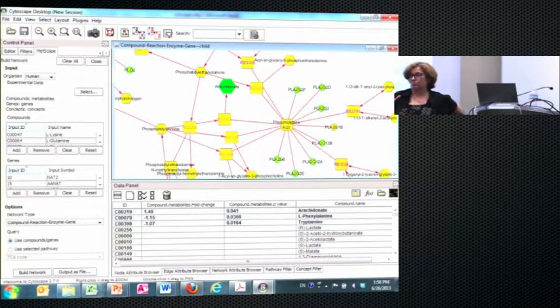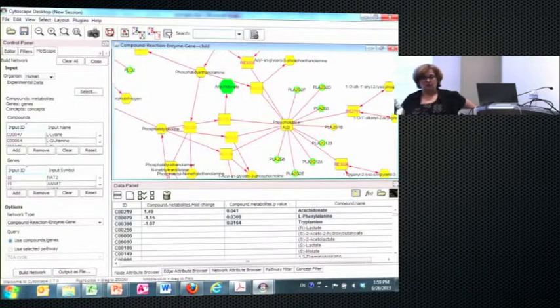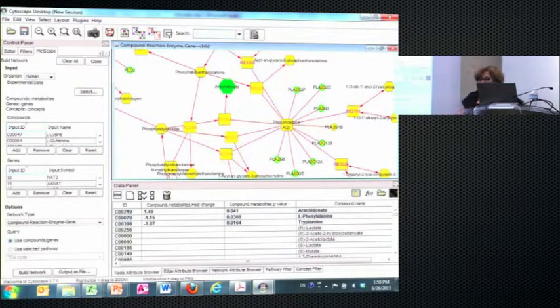But it will not be sufficient. Chances are that it will not be sufficient for a journal publication. There's a way to do that in Cytoscape. It is not particularly elegant, but there is a way to save a higher resolution image. If you have any questions, I'd be happy to advise you on how to do that if it comes to this. So hopefully, if you find the tool useful, maybe you will want to save some data someday.